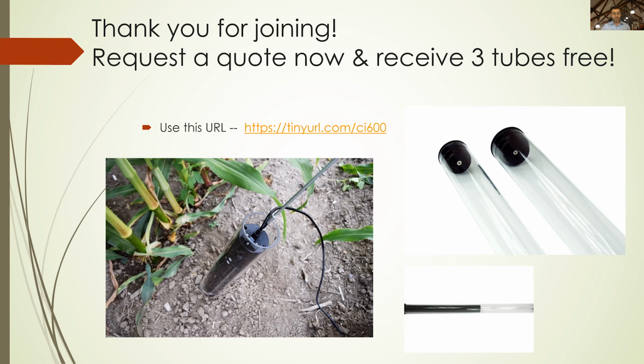All right, the next question is, did you experiment with this technology with vegetable crops? Yes, actually, as you saw in India, it's being used with maize. In the picture, I believe it's still on the screen, it's being used with corn and corn rows, but it's also been used on squash, beans, tomatoes. Actually, the list is very long. Since the 600 has been in use for over 10 years, it's been well documented. The 602 has only been around for less than a year now, but it is a fairly similar instrument, and it's getting very similar research.